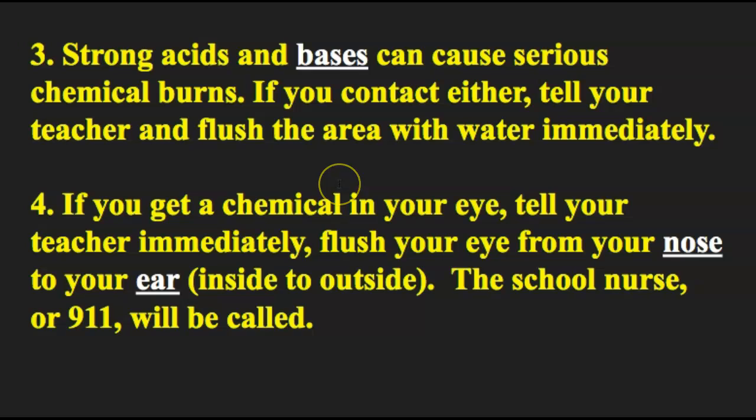If you contact either an acid or a base, tell your teacher and flush the area with water immediately. If you're at home, tell your parents right away and you may need to go to the doctor.